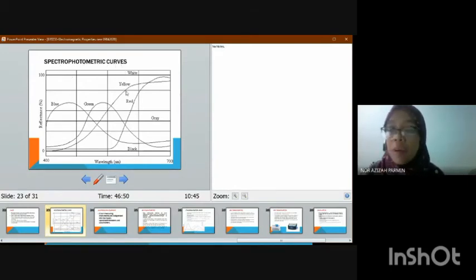Okay, macam mana nak measure this one? Kamu ambil contoh tomato, kamu crushkan dia, macam pecah-pecahkan sel-sel molekul dia, and then letak buffer ataupun kamu letaklah distilled water. Okay, tapi kalau boleh perah, dapatkan dia punya just solution, bukan solid, dia kena remove. Okay, so dapatkan color merah and then kamu check dalam spectrophotometer. Okay, so yang ada spectrophotometer and then it will give the red color, spektrofotometer tak cover sampai 700 kalau saya tak silap.